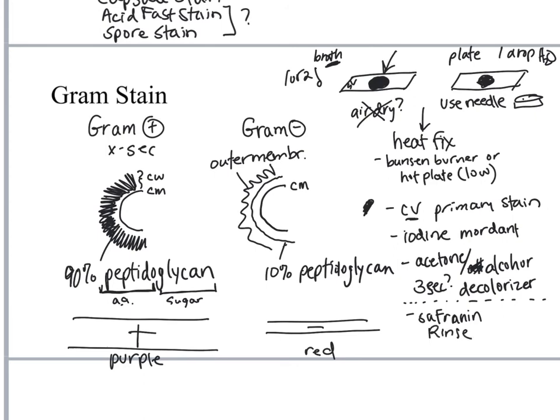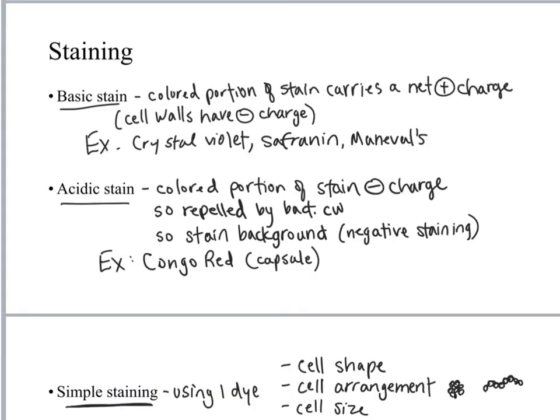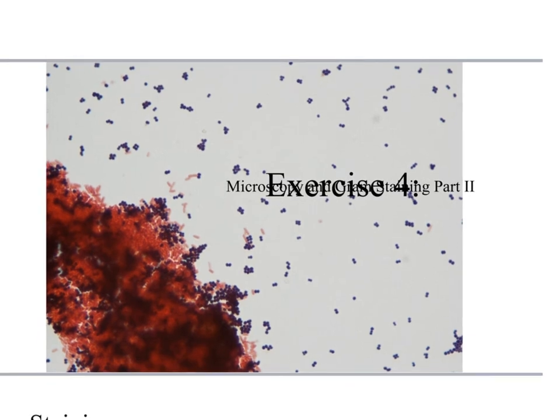We're always going to want to make sure our slide is dry before we plop it on the microscope stage, so I will show you how to blot that dry, and then you're all set. So what are you looking for? I'll go back to the beginning here.